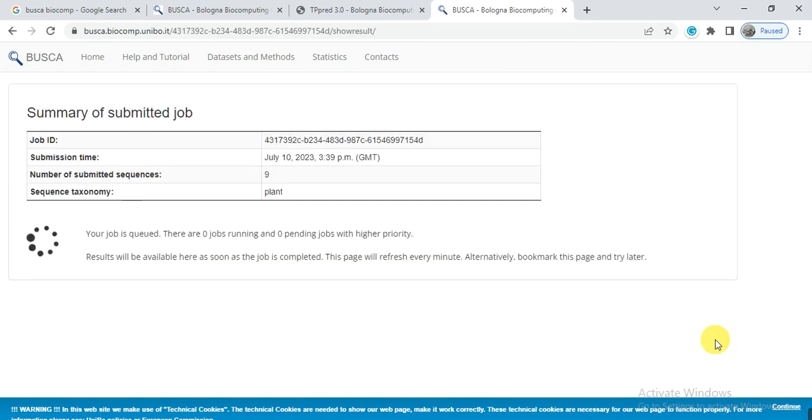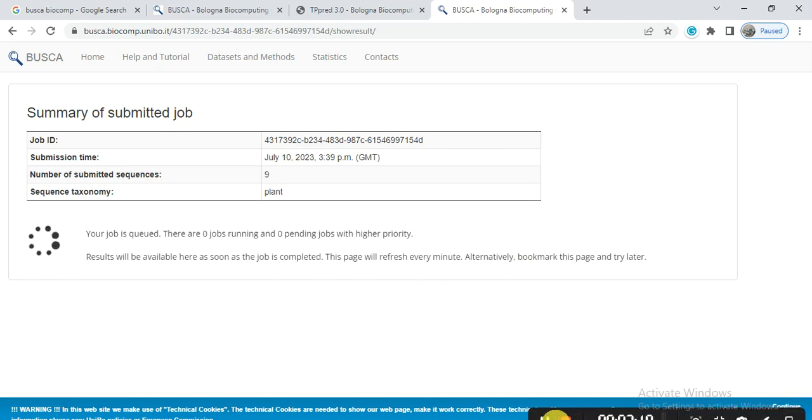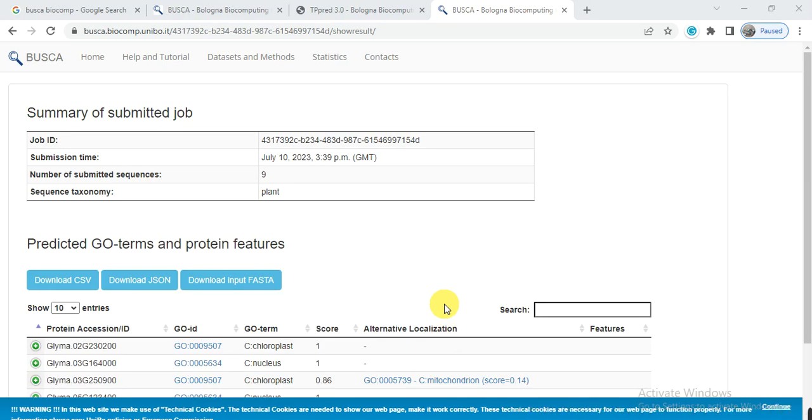So it will start the process. Here it gives some information about this, the number of sequences and the taxonomy, etc. So the process will take about 15, 20, or 5 minutes. It depends upon the number of sequences, how many sequences you have used, or the length of your sequence. If you have one sequence, it will take maybe hardly one minute or less than one minute. If you have more sequences, then it will take more time.